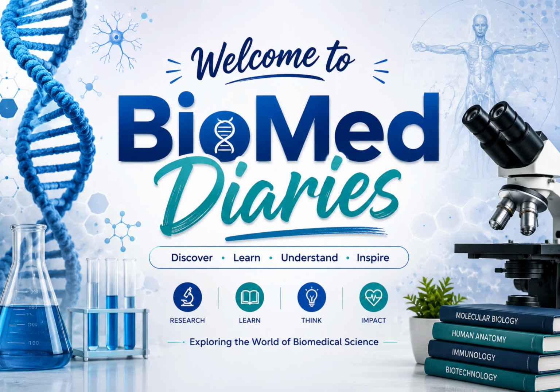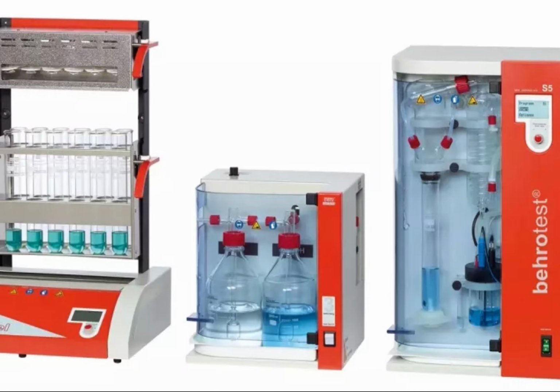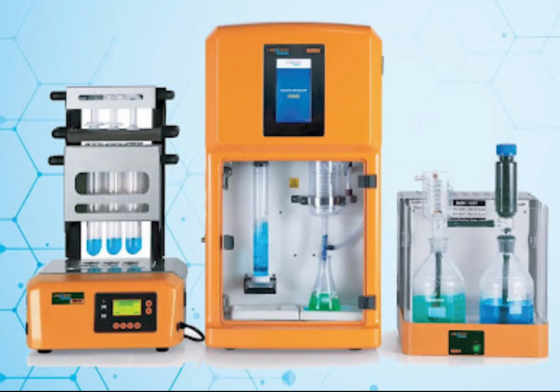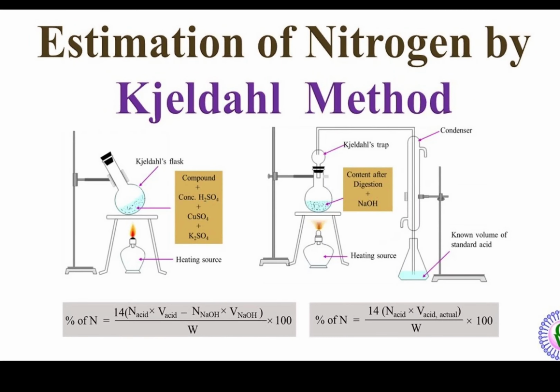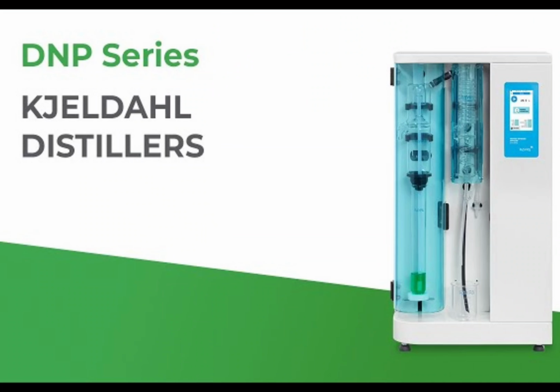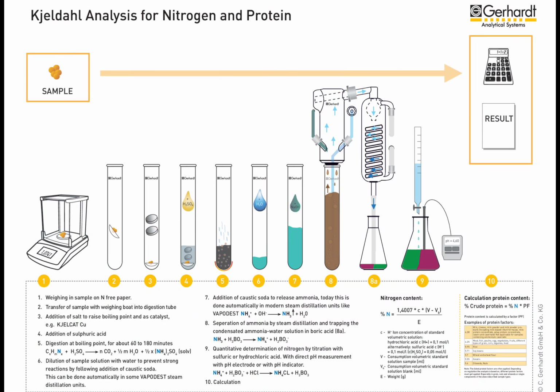So today we are going to learn about the Automatic Kjeldahl Machine, one of the most important laboratory instruments used to measure protein content by determining the amount of nitrogen in a sample. If you work in agriculture, food science, veterinary science, dairy, environmental laboratories or biomedical research, this machine is extremely useful. So let's begin.